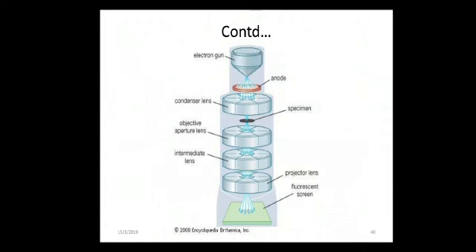The image provides a highly magnified view of micro and nanostructure, and it displays accurate information about the local crystal structure and represents the elements present in a tiny volume of a metal.